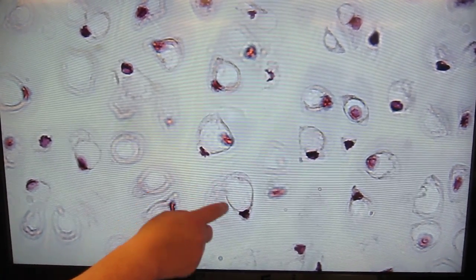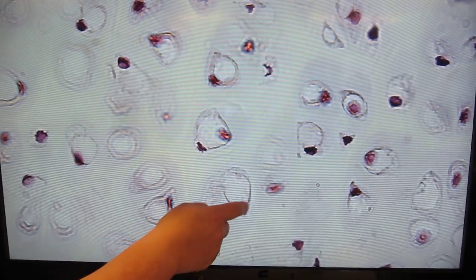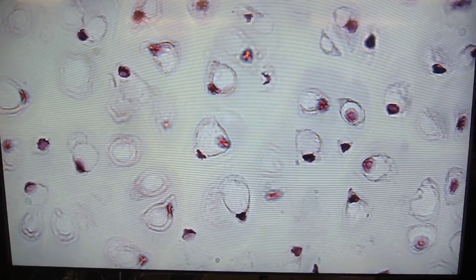Okay, sometimes people will say they look a little like fancy gemstone rings. Okay, so here's one that kind of looks like a ring. Here would be the stone, and here would be the metal portion with the setting. Okay, so hyaline cartilage, lots of matrix, cells called chondrocytes that live in spaces called lacunae, and the cells look like eyeballs, sectioned eyeballs, or rings. Hyaline cartilage.